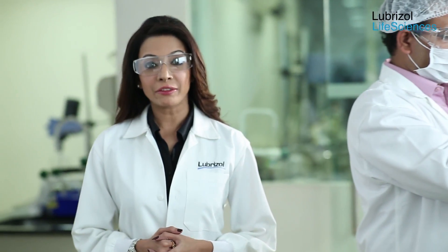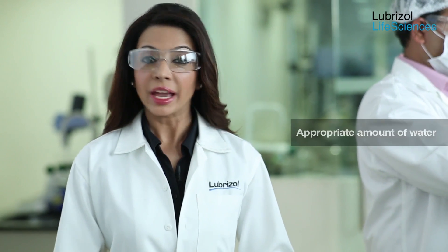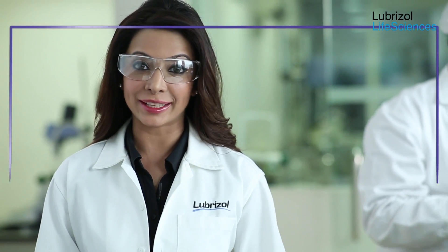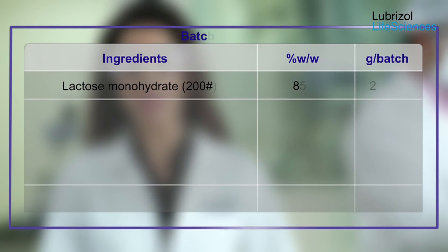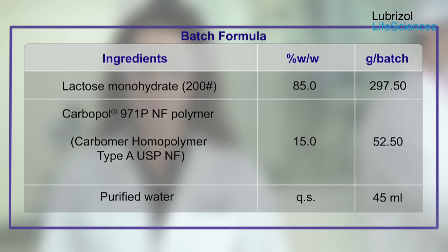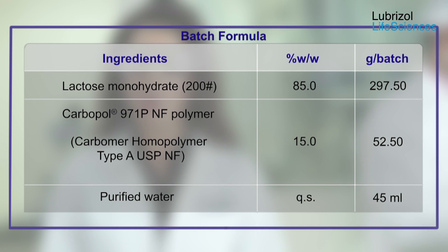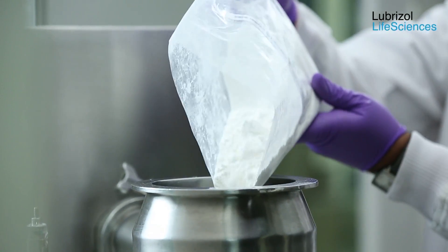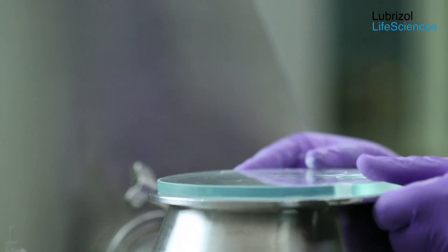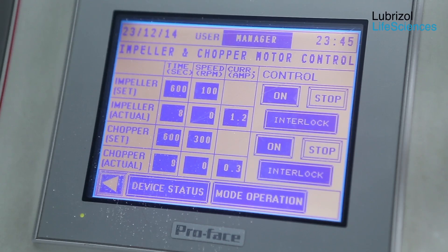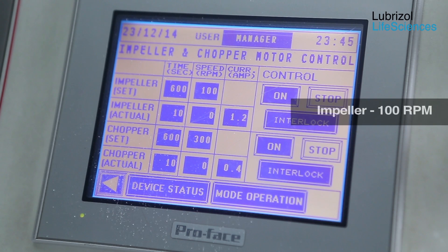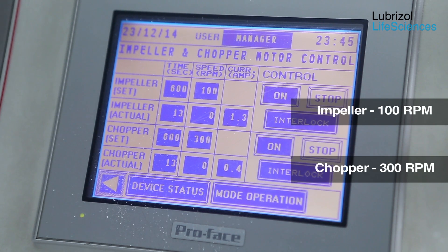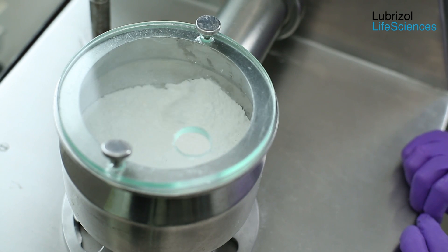In the first example, we will demonstrate an appropriate amount of water addition. The formulation comprises 85% lactose and 15% Carbopol 971P NF polymer. The amount of water used represents 13% of the dry blend, which is an appropriate amount for this formulation. Lactose and Carbopol 971P NF polymer are passed through a 40-mesh screen and loaded into the high shear mixer. The impeller is set at 100 rpm and the chopper at 300 rpm; dry blending is continued for 10 minutes.